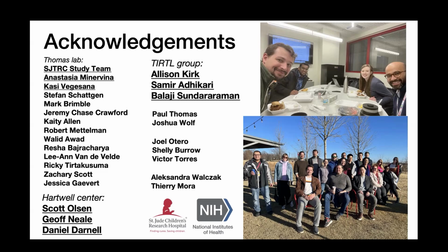I'm just wondering, in terms of scaling towards bigger cohorts, is there any clever trick you could do by, say, instead of doing one donor per plate, could you take 4 donors and 4 plates, and mix each donor across a couple of plates, with each one's big clones diluting out its neighbors, kind of thing?